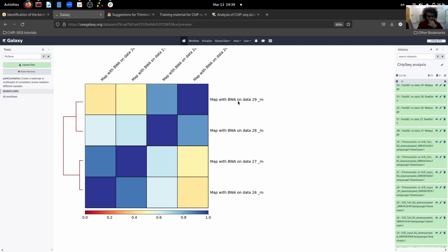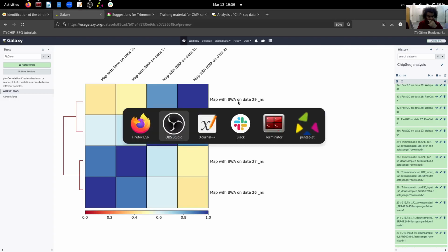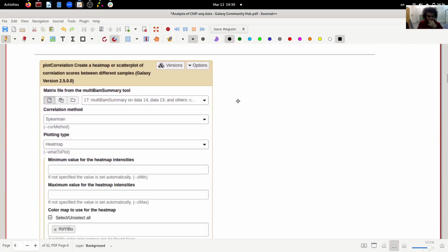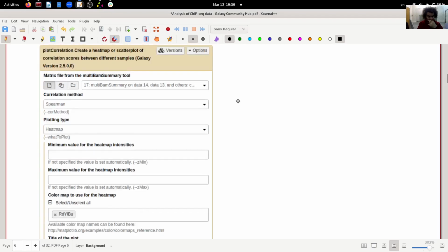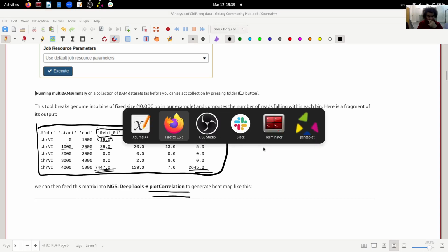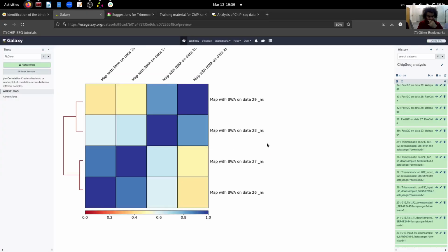And with good signal, I mean the following. Let's go back to our notes here, and let's go to the next step.